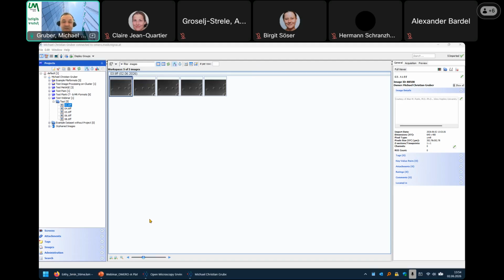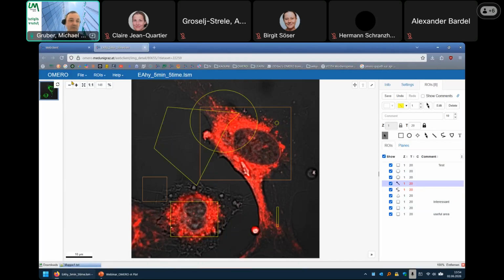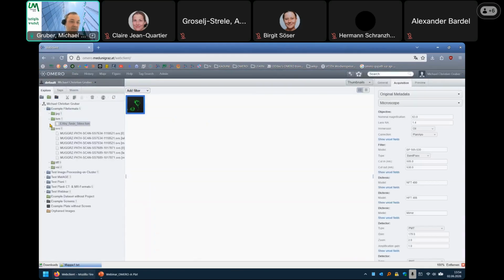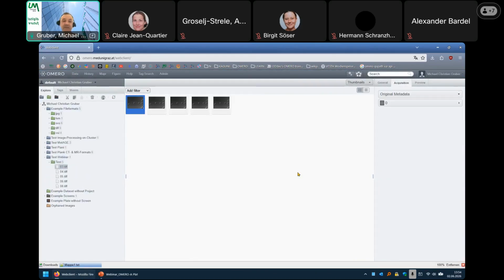So I then can quit the OMERO Insight and go back to my OMERO web. If I renew the view here as well, then the imported data appears here as well.